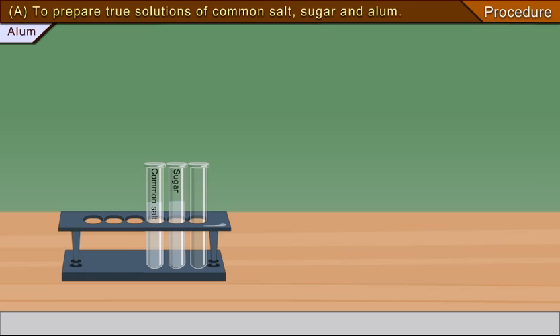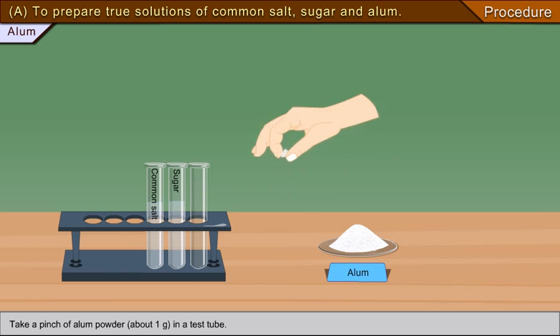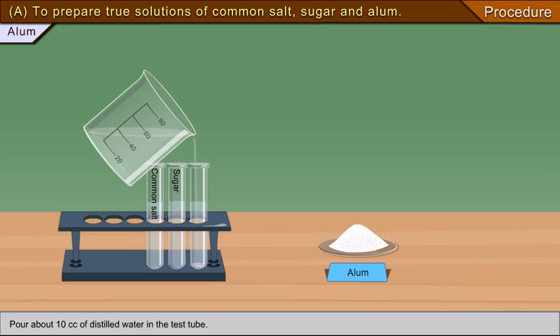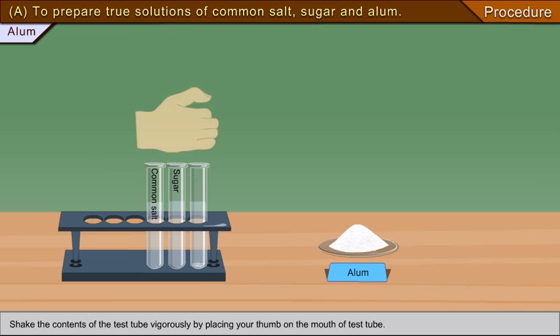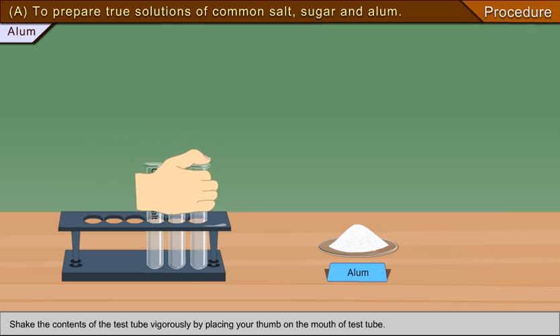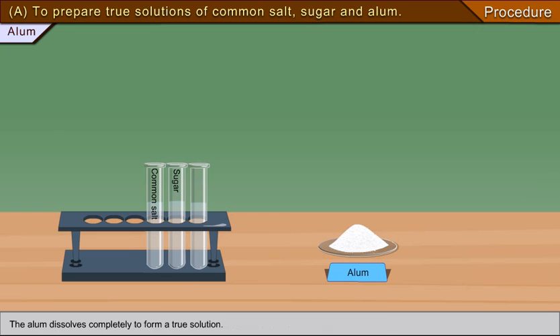To prepare a true solution of alum, take a pinch of alum powder (about 1 gram) in a test tube, pour about 10 cc of distilled water in the test tube, and shake the contents vigorously by placing your thumb on the mouth of the test tube. The alum dissolves completely to form a true solution.